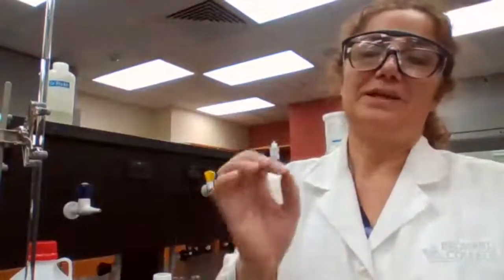I still have it in the test tube rack, and I'm going to show you later that it's completely dissolved in sodium bicarbonate. It just takes a longer time. You either have to wait a long time or look for formation of bubbles. If the bubbles form, that means H2CO3, carbonic acid, has been produced in the chemical reaction, and carbonic acid is not stable. It decomposes to H2O and CO2, and you see those bubbles of CO2, and that's an indication that the compound dissolved in or reacted with sodium bicarbonate.